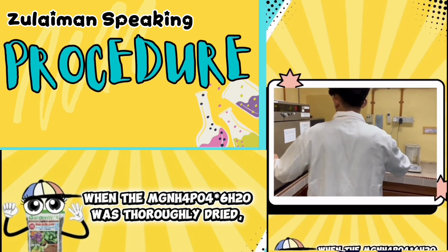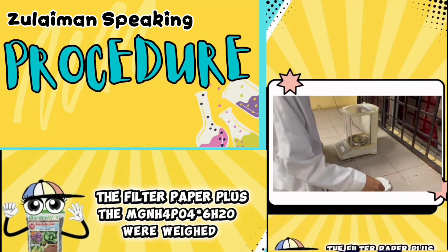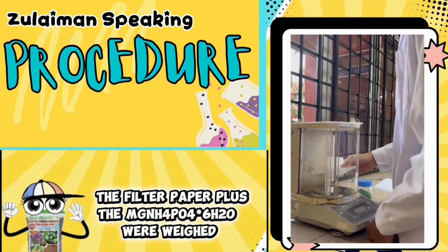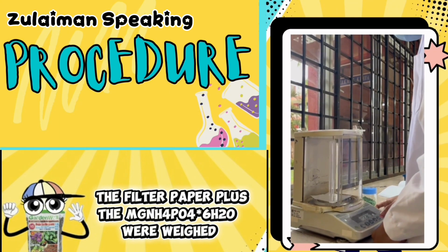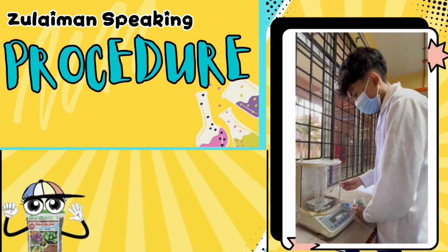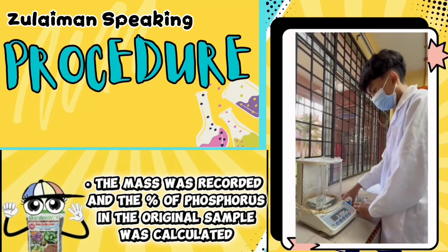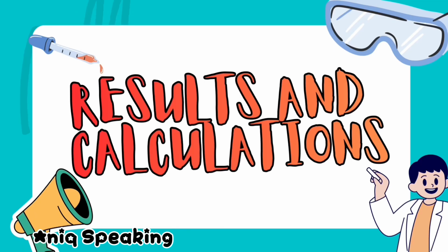When the magnesium ammonium phosphate hexahydrate was thoroughly dried, the filter paper plus the magnesium ammonium phosphate hexahydrate were weighed. The mass was recorded and the percent of phosphorus in the original sample was calculated. Now we move to results and calculation.